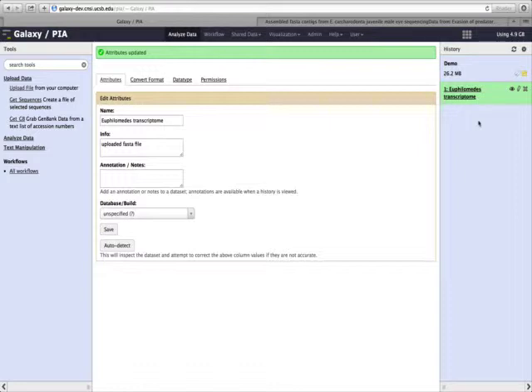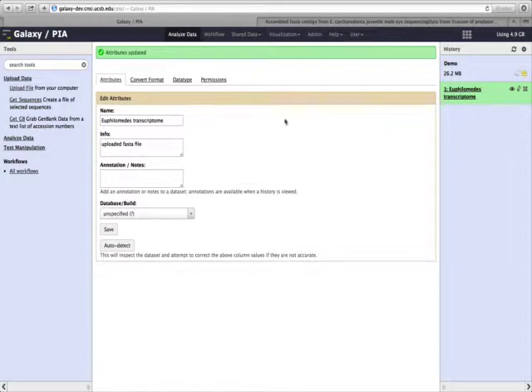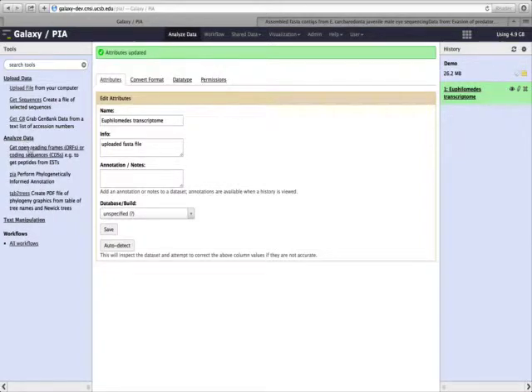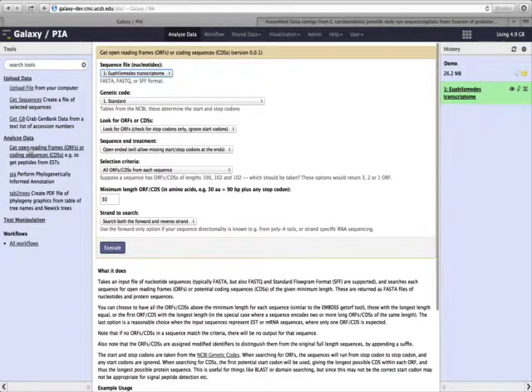PIA actually uses amino acid sequences of proteins. So we could either upload these directly into the website if we have them, or we can generate open reading frames using tools on the PIA website. Under Tools here, we want to click on Analyze Data, and then click on Get Open Reading Frames.